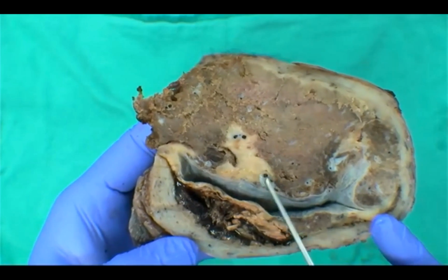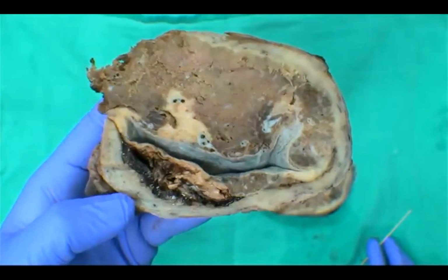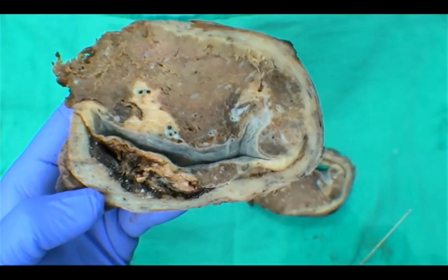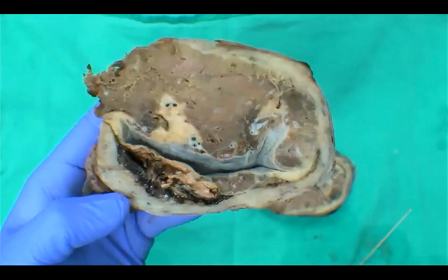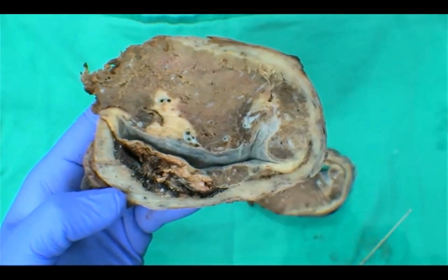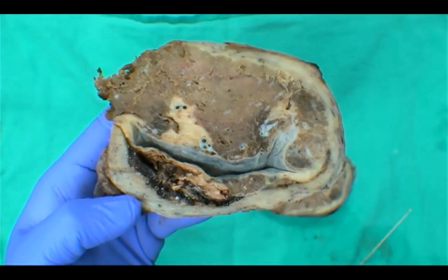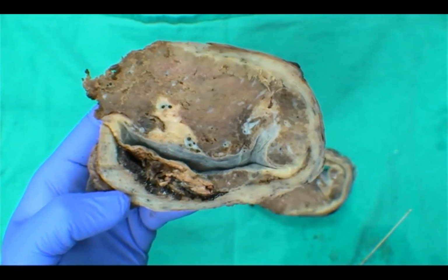I don't have the umbilical cord here with me, but yes, there are other recommendations in terms of what else to include in your gross description. If everyone has a moment to go through the article, they also include a very helpful table where they prescribe other important things to note in your gross description, such as the percentage of invasion of the placenta, as well as location and the area of disruption of the serosal surface. So there are a couple additional things that are nice to include in your gross description to help properly document whatever is happening.